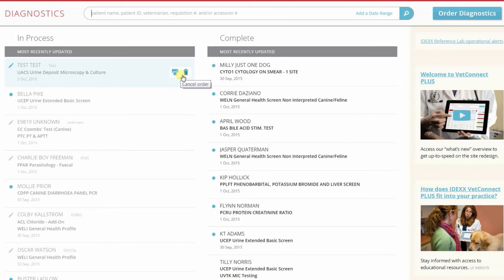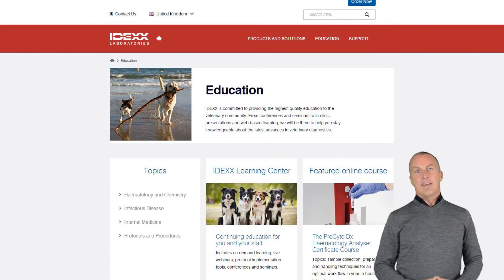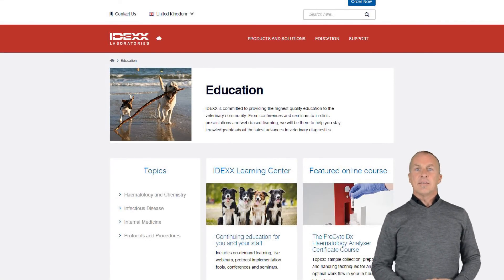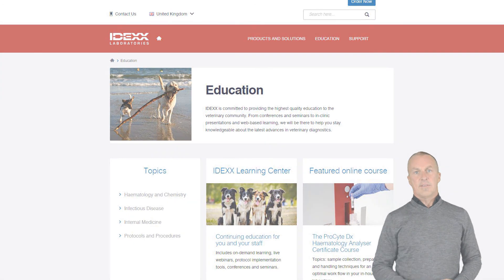To cancel orders in this state, you'll need to contact customer support at the reference laboratory. To learn more about VetConnect Plus, visit the IDEXX Learning Centre where you can find other educational offerings.